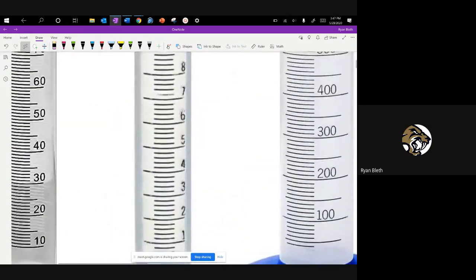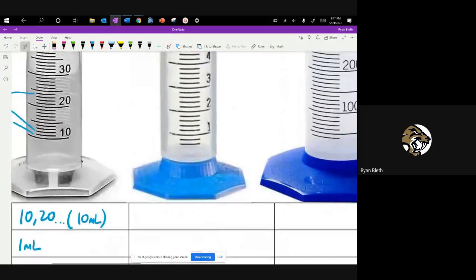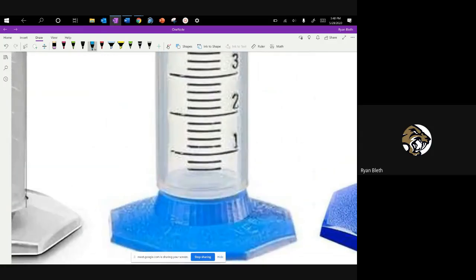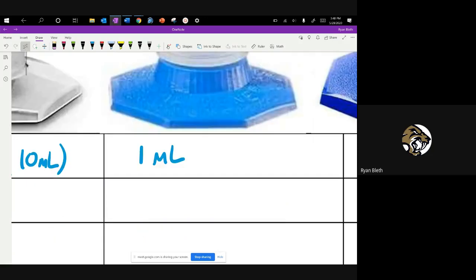On this second device, we've got major markings labeled to the nearest one milliliter — lines for one, for two, up to ten. I've got smaller divisions here. If you look at the closeness of these smaller lines in between, there are four lines creating five spaces between each of the major divisions. So those lines would represent 1.2, 1.4, 1.6, 1.8, and 2.0. Our smaller divisions represent a marking of the nearest 0.2 milliliters.